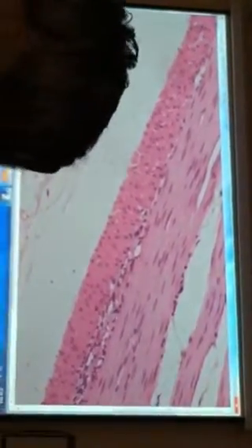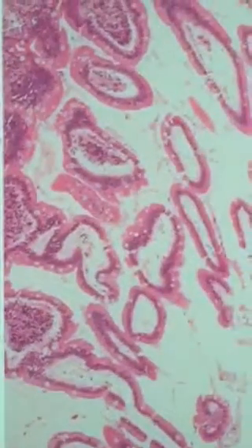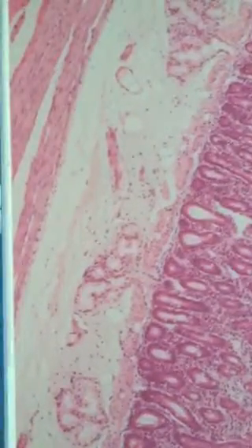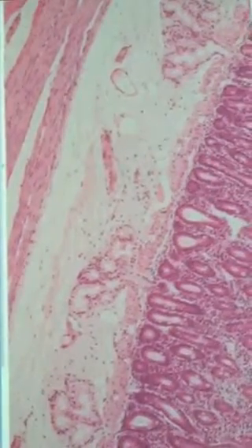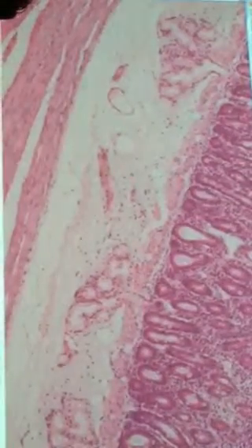The serosa. Okay, so duodenum. What's noteworthy about the duodenum? Duodenal glands. Yes, you saw villi, you know you're in the small intestine, and then I will scroll down and show you the areas where you can notice the distinguishing feature of the duodenal glands. Plicae circulares, that's a big fold. We'll talk about that. That's not visible. Any questions on that one?